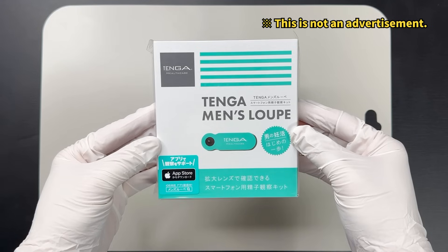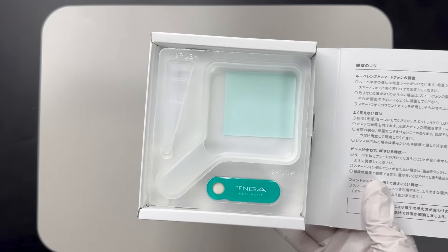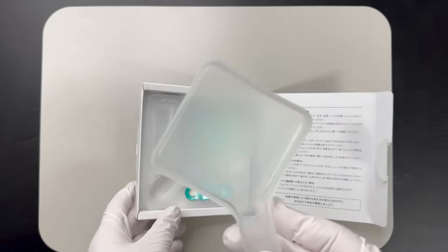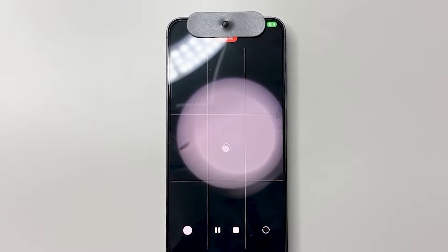This is the sperm observation kit — it's made by a company called Tenga. The contents are very simple: it comes with a container for semen and a magnifying lens that you can attach to your smartphone camera to turn it into a simple microscope.